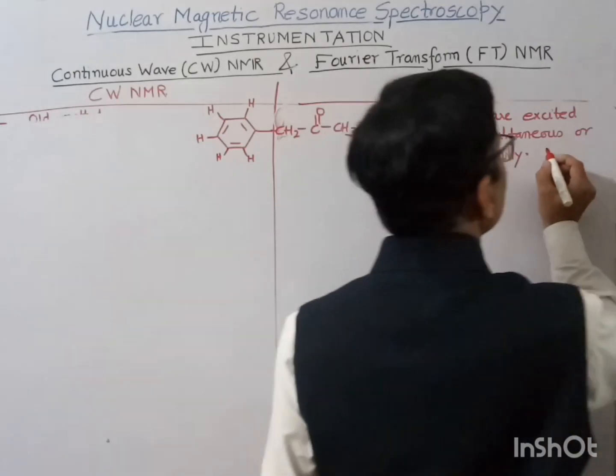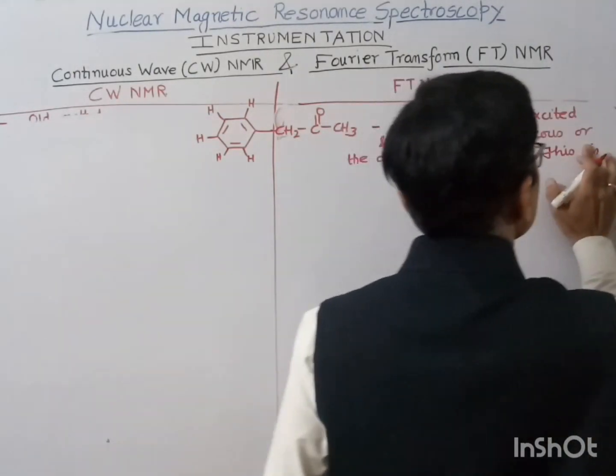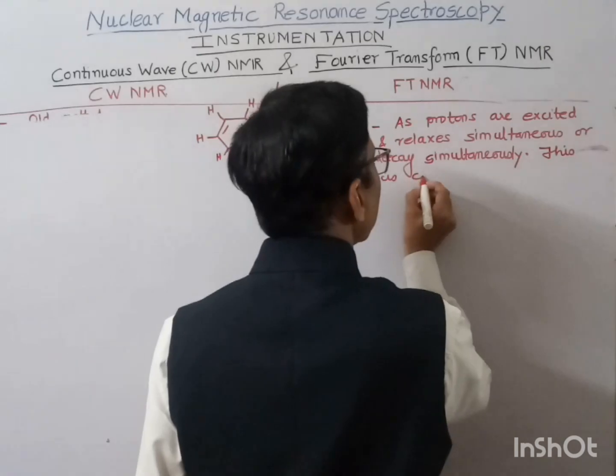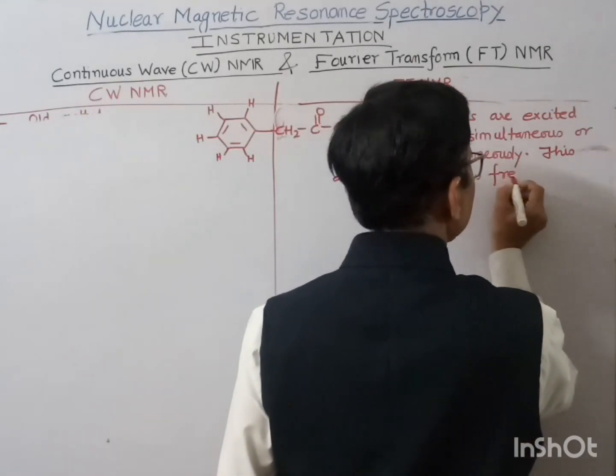This type of decay is called free induction decay.